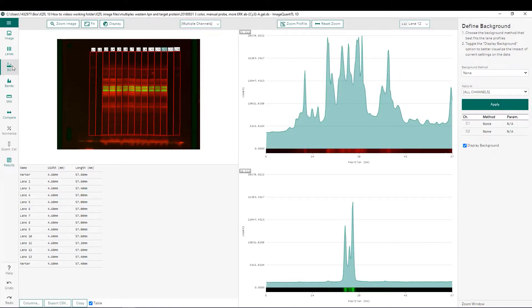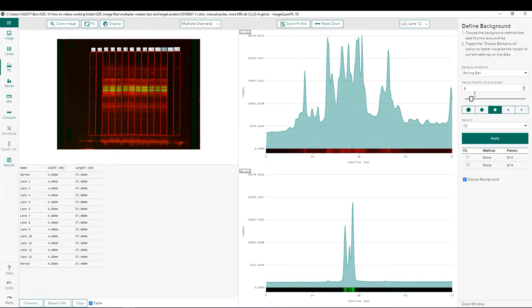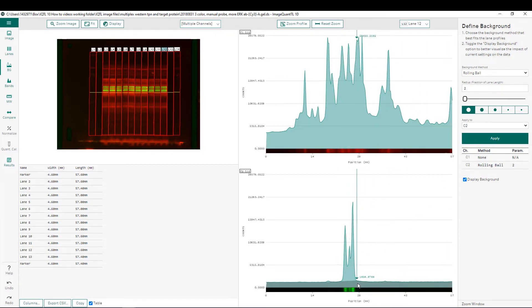In the background subtraction step, for this type of image I prefer to do a separate background subtraction for my total protein normalization channel and my protein of interest channel. We'll start with our protein of interest channel, where I prefer to do a rolling ball background subtraction. I will choose a radius of half of my lane length and apply it. We can see that this was specifically applied to our protein of interest channel.